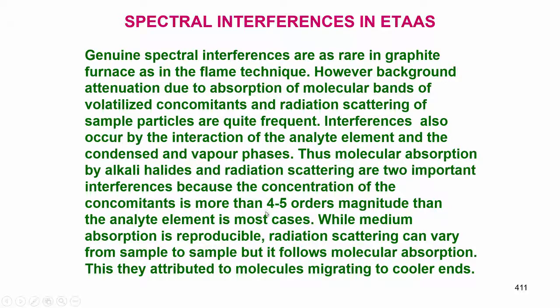What we mean to say is the scattering of radiation is more important and the background is higher. The background concentration is 4 to 5 orders of magnitude more than the analyte element in most cases.